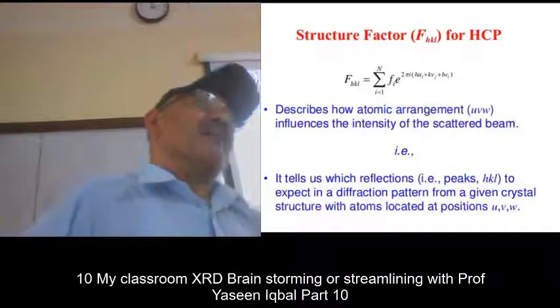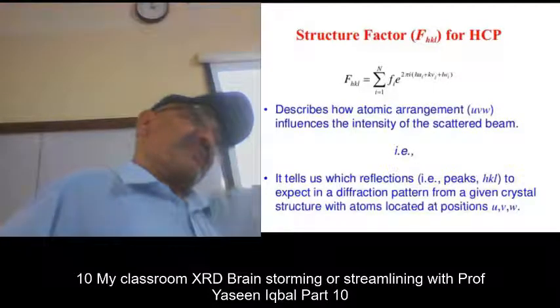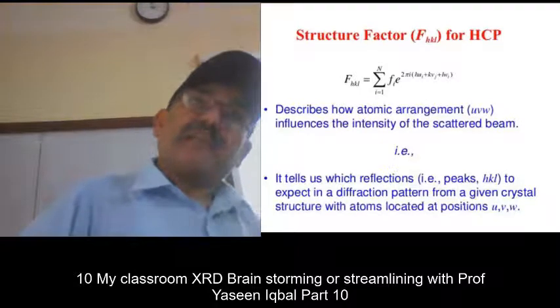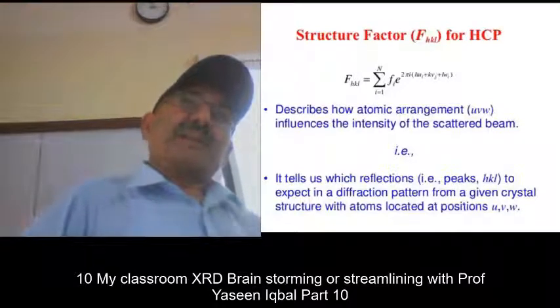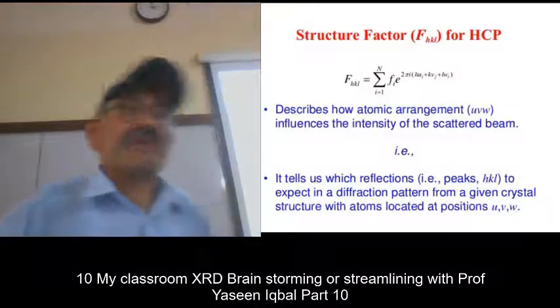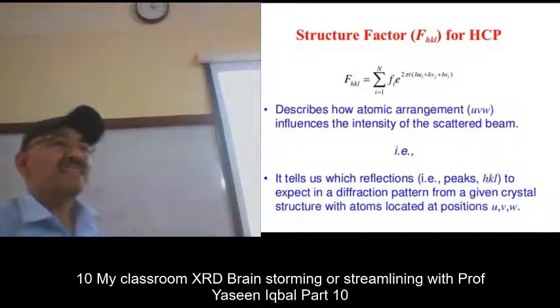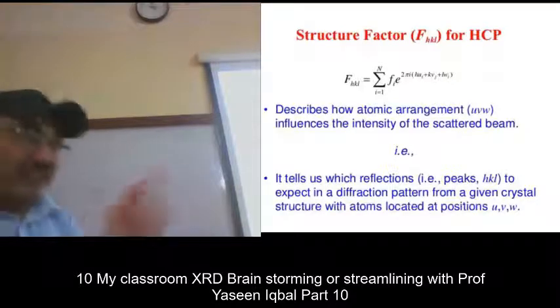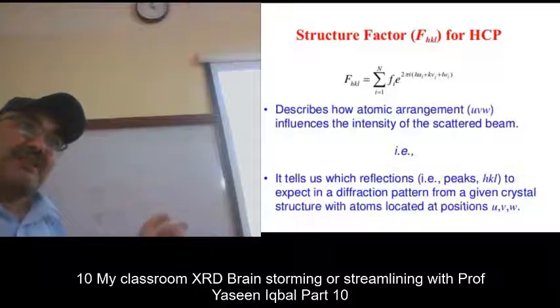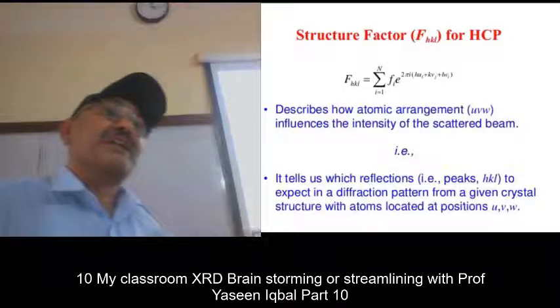If the overall structure factor becomes non-zero, then there will be some intensity. But if the overall outcome for the specific values of HKL is 0 structure factor, there will be no intensity.